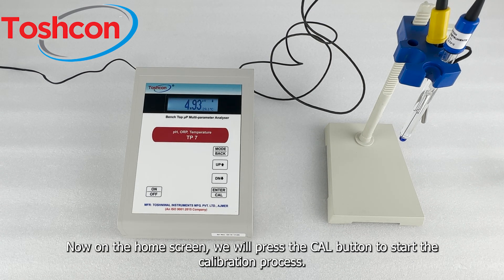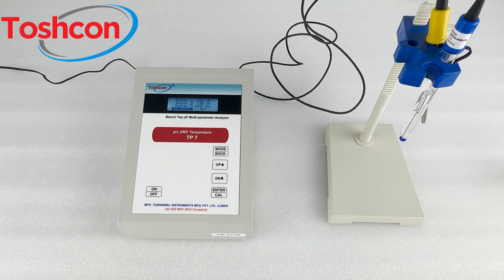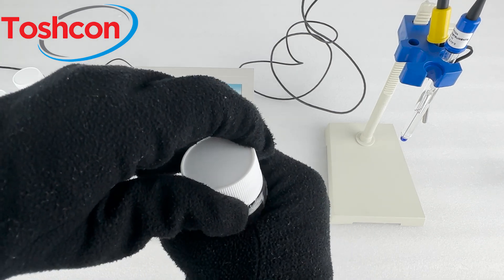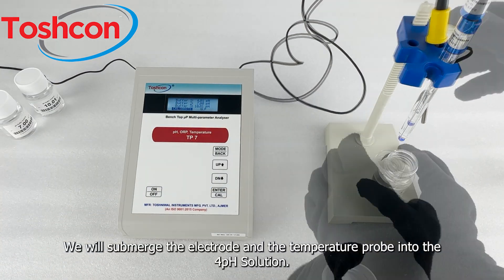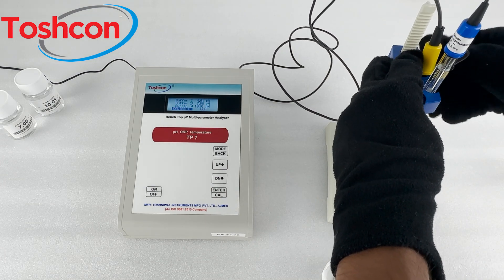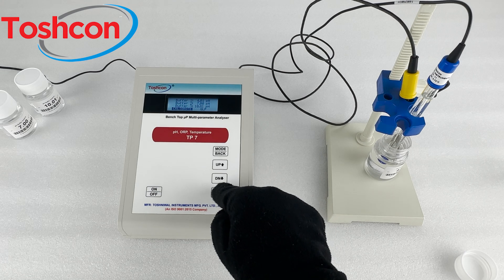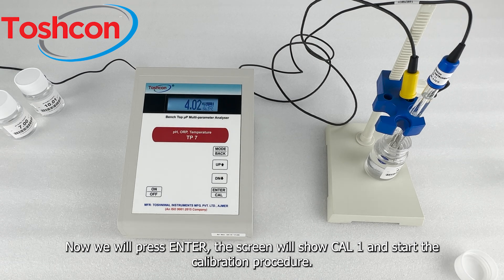Now on the home screen, we will press the cal button to start the calibration process. Here we have calibration solutions that we can use to calibrate the instrument. We will submerge the electrode and the temperature probe into the 4 pH solution. Now we will press enter; the screen will show cal 1 and start the calibration procedure.